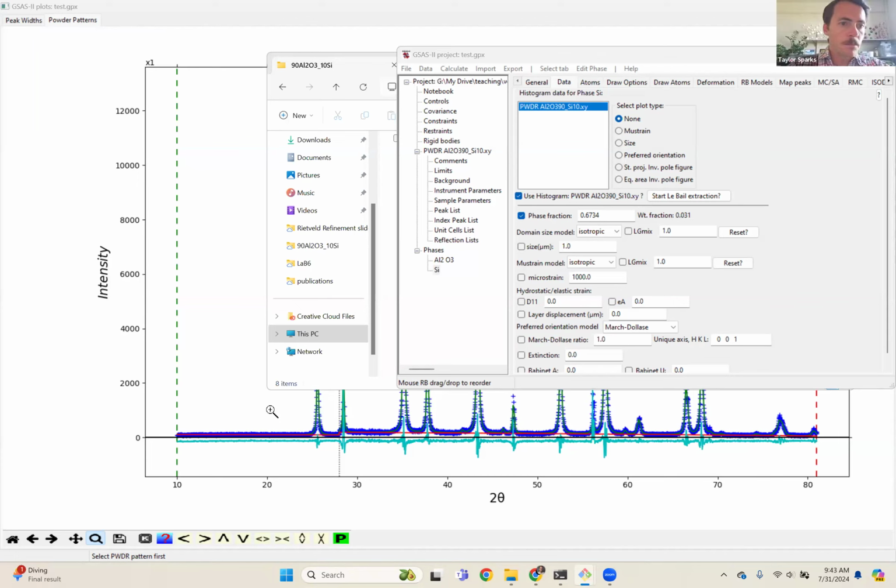Okay. Somebody asked if we get lower values for the default values of U, W, X, Y, and Z, but still positive values, are those still physically possible or physically realistic? Okay, so for the U, W, X, Y, and Z, those ones don't have constraints about realistic nature for being positive or negative that I'm aware of. The thermal displacement parameters shouldn't be negative because that doesn't make sense for it to have a negative vibrational space. But the U, W, X, Y, Z, I don't know. Those aren't based off of physics.